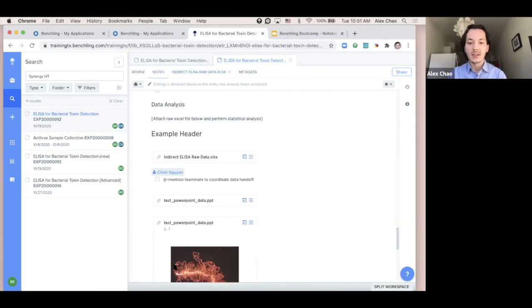So this brings us back to our third poll question, our third and final question. And I'll launch this poll. So for our last question, we're wondering, without proper notebook searching, has finding specific notes been difficult for you in the past? So please do rate whether or not this has been a pain point for you. Wonderful. So thanks everyone for filling out this poll. So I will share the results.